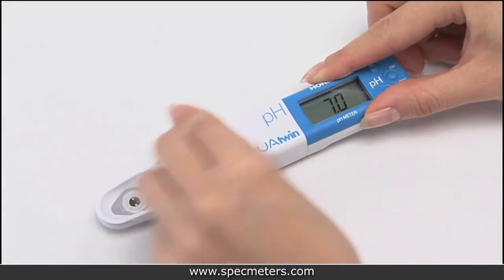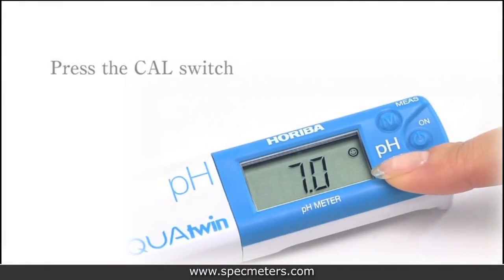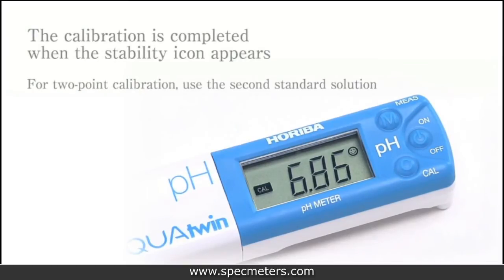Close the lid on the sensor so light won't affect the reading, and press and hold the cal switch until it starts flashing. The calibration is completed when the stability icon appears and the cal icon is no longer flashing.